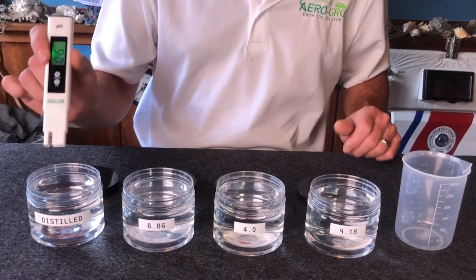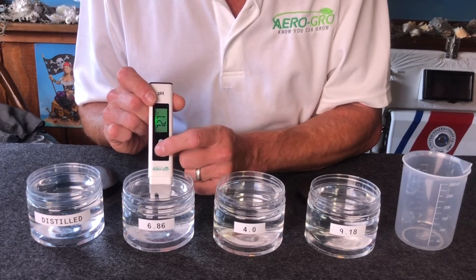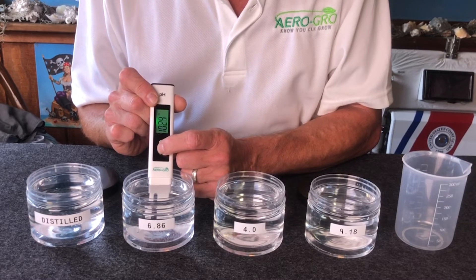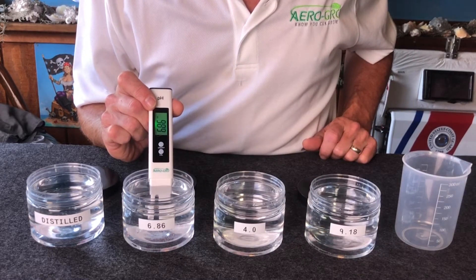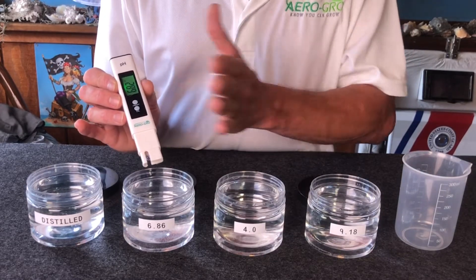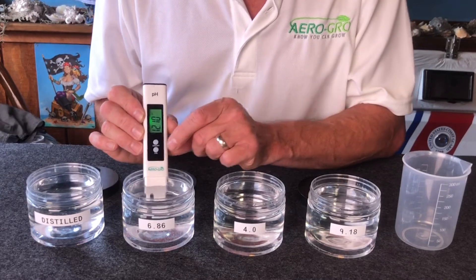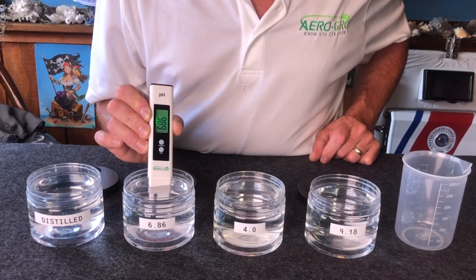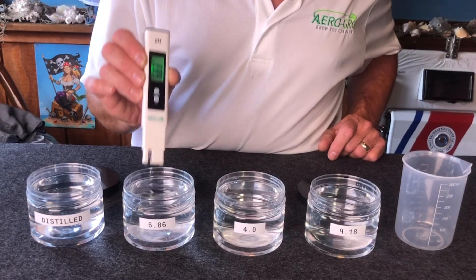Always start by rinsing the meter in distilled water. Insert it into the 6.86 solution, press and hold the calibrate button — that's the bottom button labeled CAL — for five seconds. The numbers will jump around; that's completely normal. After five seconds, release and keep it in the liquid. It will start flashing and then stop flashing. When it stops flashing, you are calibrated at 6.86. Take it out, rinse it off, and shake it a little.